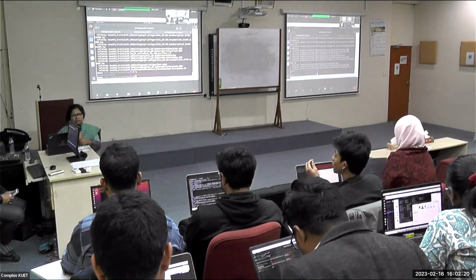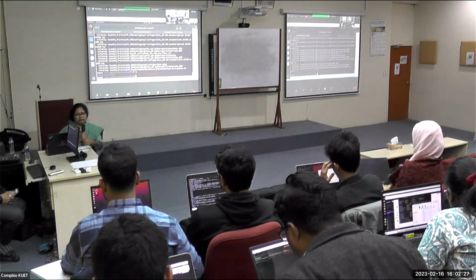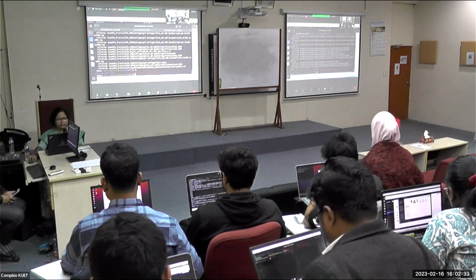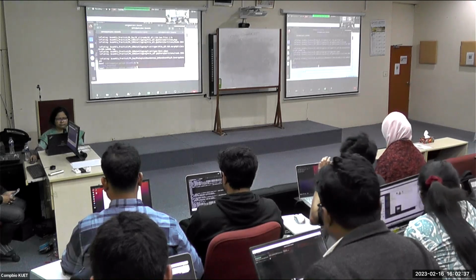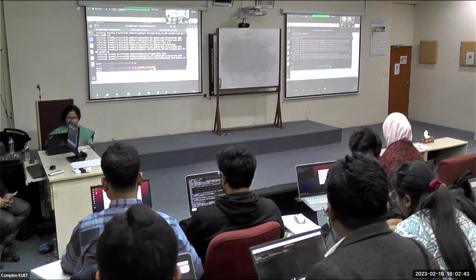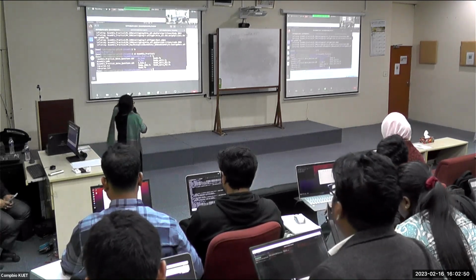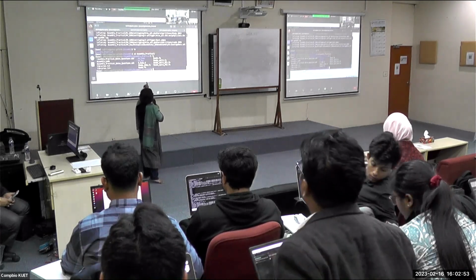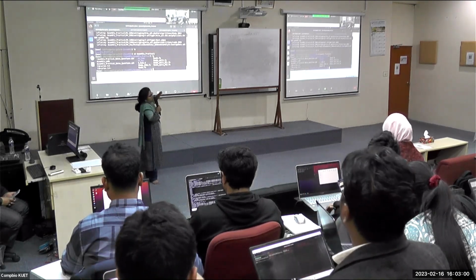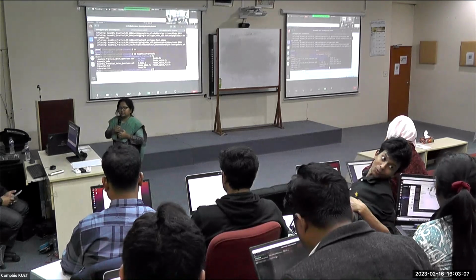There are many files inside this folder, but we will not use all of them. Just have this folder for that raw read that we would like to assemble. So we will actually need this file, the read_split.fa. This is a read split file, and we will try to assemble the sequences inside this file to get a consensus sequence.